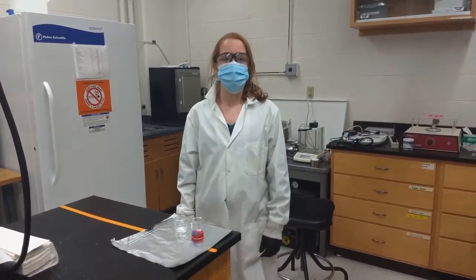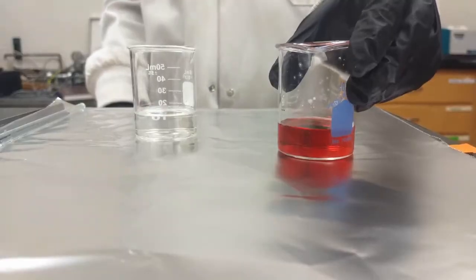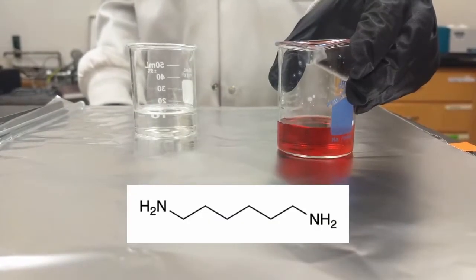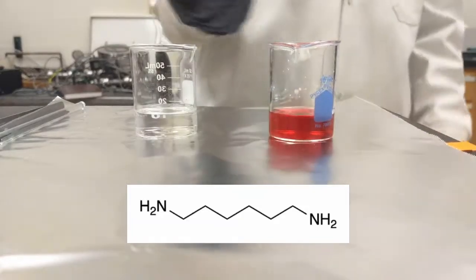In our case, we will be using hexane and water as our immiscible liquids. We have the diamine monomer that's dissolved in water. We've dyed this red so that you can see the difference.